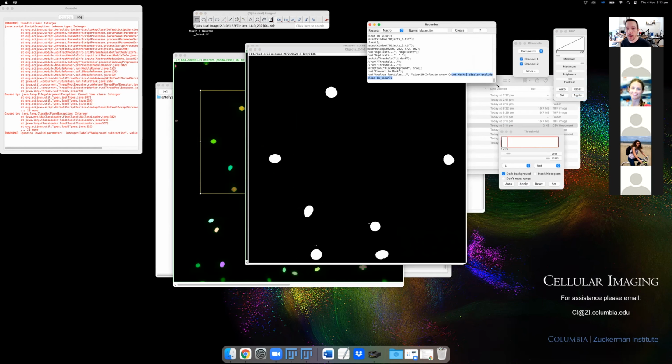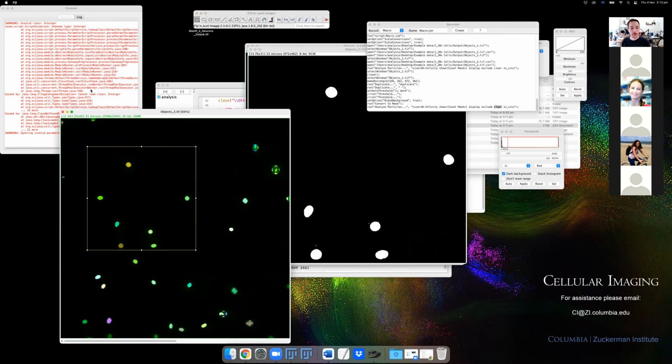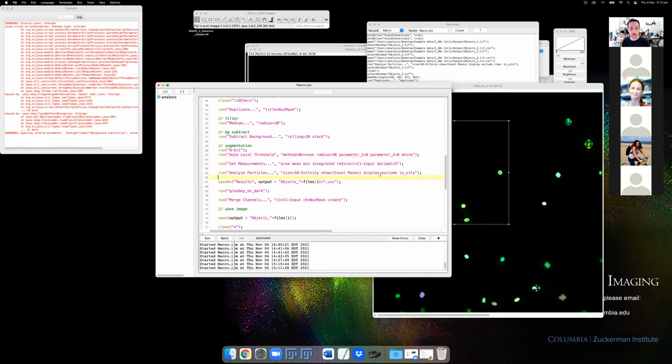So the one we wanted to have included is, oh yeah, clear. Sometimes it's very easy just to do that in case you can't remember what to type in. So this is our command. We just need to include clear here. Okay, so that fixed that.